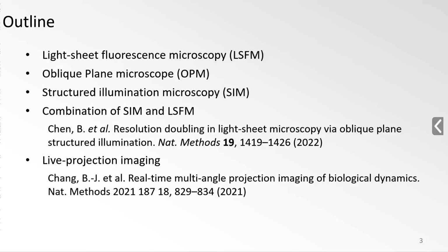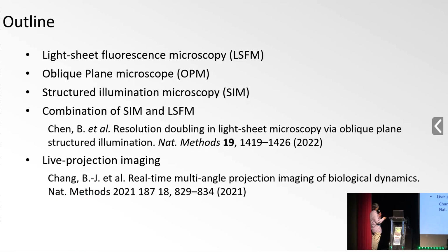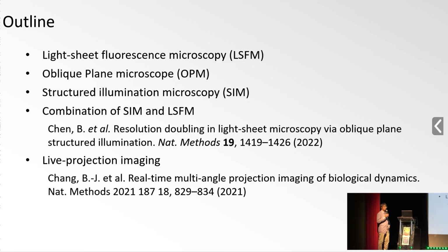This is my outline, and I will keep the introduction to light sheet fluorescence microscopy very short. I'm going to go through OPM, structured illumination microscopy, and the combination of SIM and light sheet fluorescence microscopy. If time permits, I would like to talk about live projection imaging, which we published some years ago, and we feel it's a little bit underappreciated. I hope I have some time to talk about that. I forgot to start my alarm, so I hope I don't talk too long.